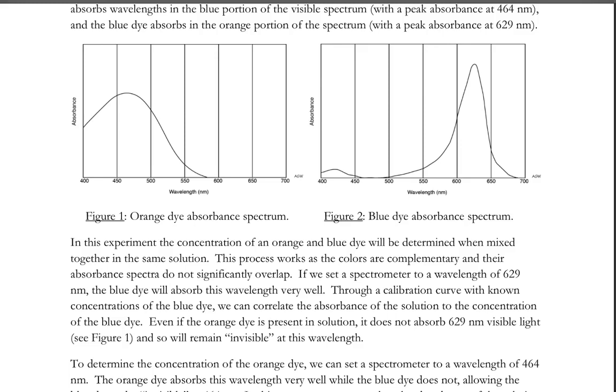What is similar about this experiment is we will have the stock solutions. We will have an orange stock solution with a stock concentration. We will have a blue dye stock solution with a stock concentration. Those will be given to us. I will give them to you in the experiment video, so we will have their initial concentrations.